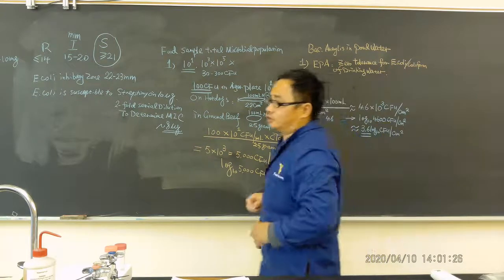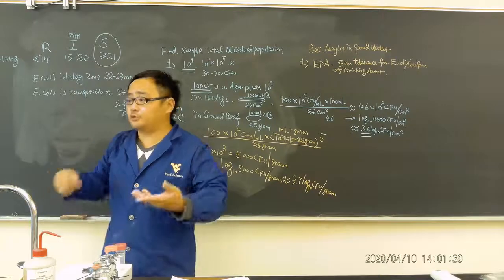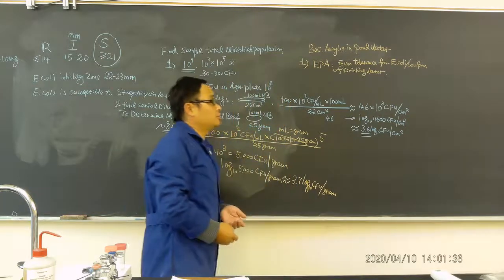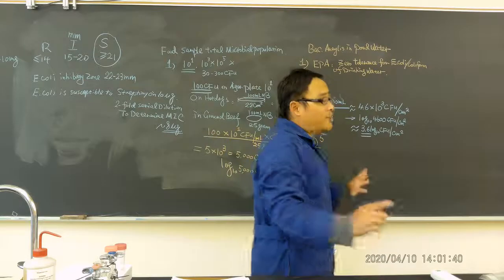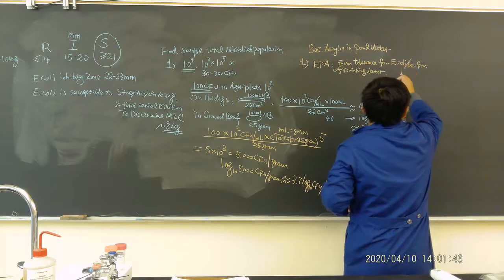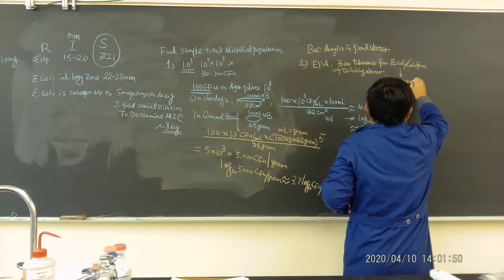Now, of course, you're going to say chlorine, the soft water, but those are chemical issues, not microbiology issues. From the microbiology standpoint, it's zero tolerance for E. coli and coliform. So ideally, you can drink it. But not really, because E. coli and coliform most of the time indicate fecal contamination.